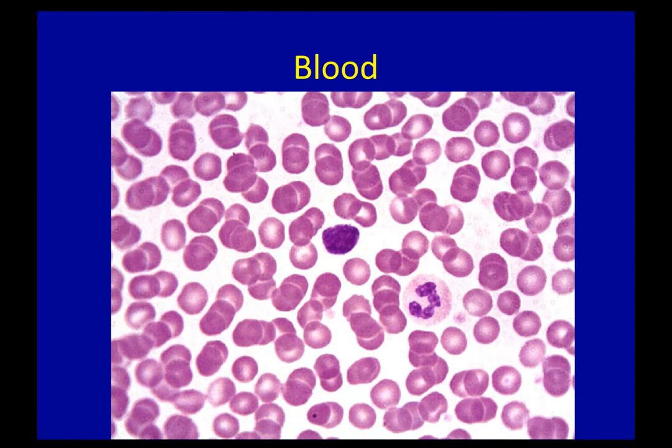Finally, we have the blood. The blood is the only liquid tissue that we have. So what kind of tissue is it? You have 4 options: epithelial, nervous, muscular, or connective. So it's connective tissue. Identify the slide. It's the blood. You can always tell blood because of these little cells right here. That's an awful color to use. Hang on. Because of these little cells right here.